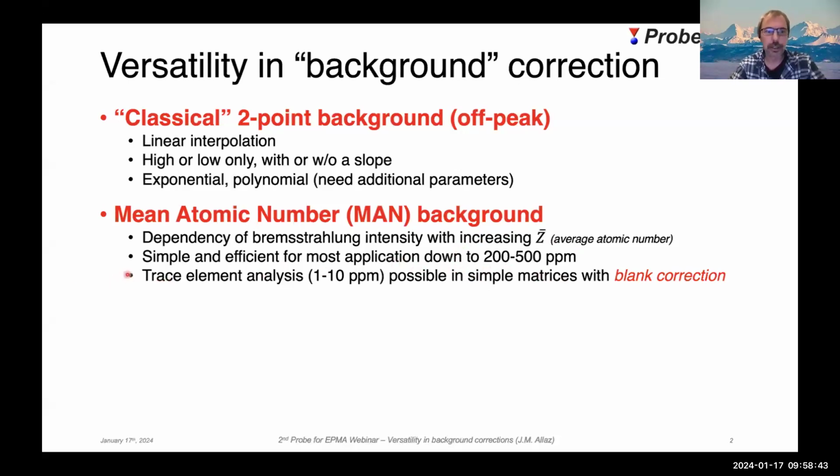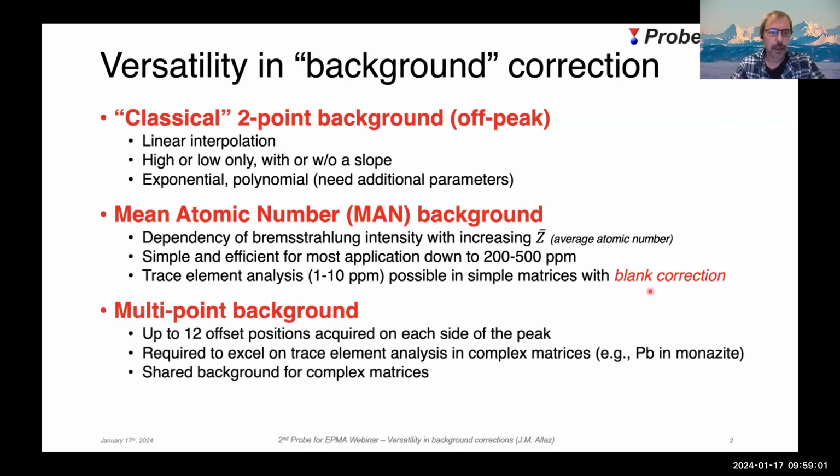These accuracy issues for trace elements, so elements below 100 ppm or so, will be somewhat resolved in simple matrices by applying a blank correction. I'm not sure if I will have enough time to go through these blank correction options. This might be reserved for another seminar.